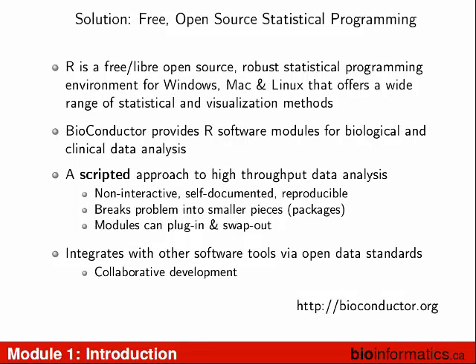And there's been lots of people who contributed stuff to this Bioconductor. It's been widely used for lots of different kinds of things. So R is a statistical programming language at its root. So if you're doing math and stats in some university somewhere, you're probably going to be using R, and they use it for lots of different statistical purposes. Robert Gentleman, who's doing a lot of development in R, and others, have developed packages to do bioinformatics analysis. If you're doing microarray analysis, for example, probably one time or another you've used R, or somebody that you know and love has used R to analyze your data, because it's a really good way to do statistical analysis, and same also for sequence analysis, and obviously now for R, for flow.